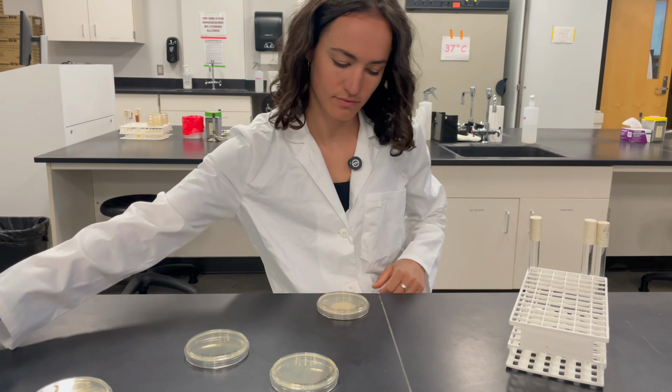We also incubate upside down, which is maybe not intuitive at first, but it helps prevent condensation and dripping onto your sample. I've already given you a sneak preview that I've sampled my mouth and my armpit. I also sampled my hand by simply touching it to the petri dish, and then took a quick trip to get a soil sample from the topsoil right outside of the science building. Next, we toss it all in the incubator.